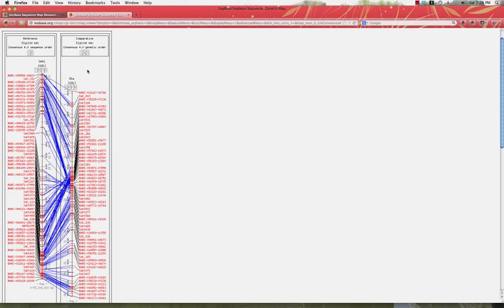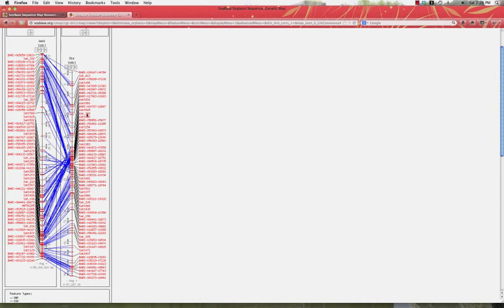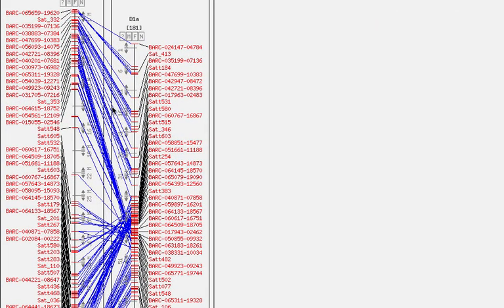Presented here is D1A linkage group versus GM01, which is the sequence-based map. A quick perusal of this shows that most of the map looks fairly good in terms of placement of the markers in order, going from top to bottom.